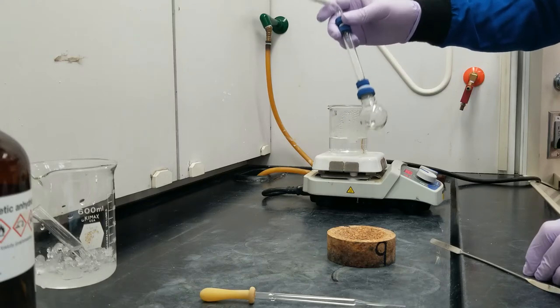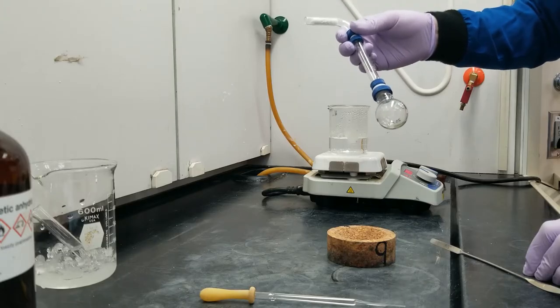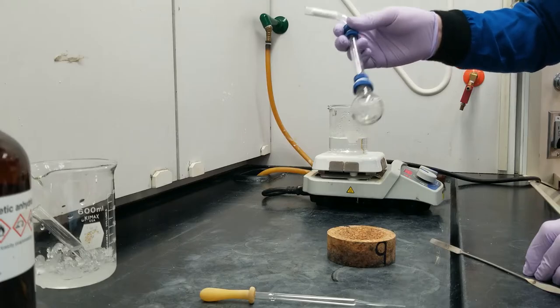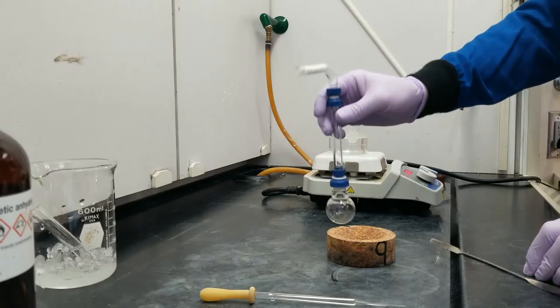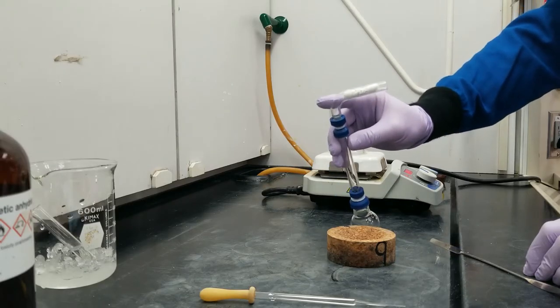However, there's a problem. The reaction is actually very sensitive to water. The acetic anhydride reacts with water to become acetic acid, and that's not useful to us. So the key to making this reaction still work is this guy right here, this drying tube.